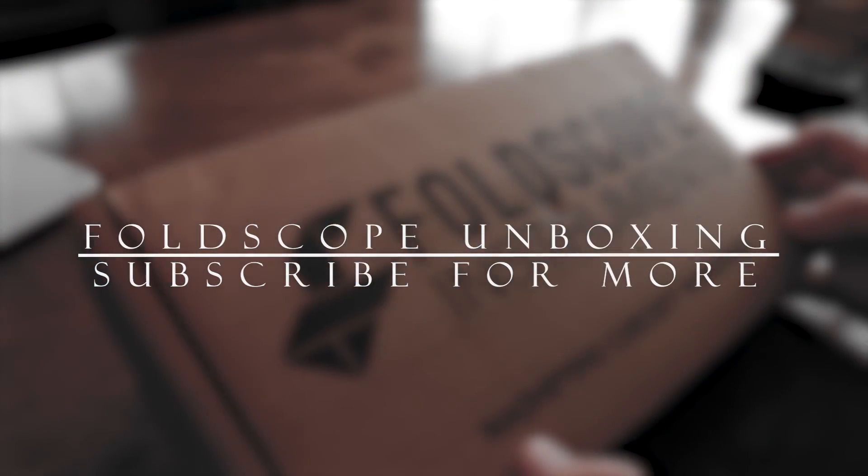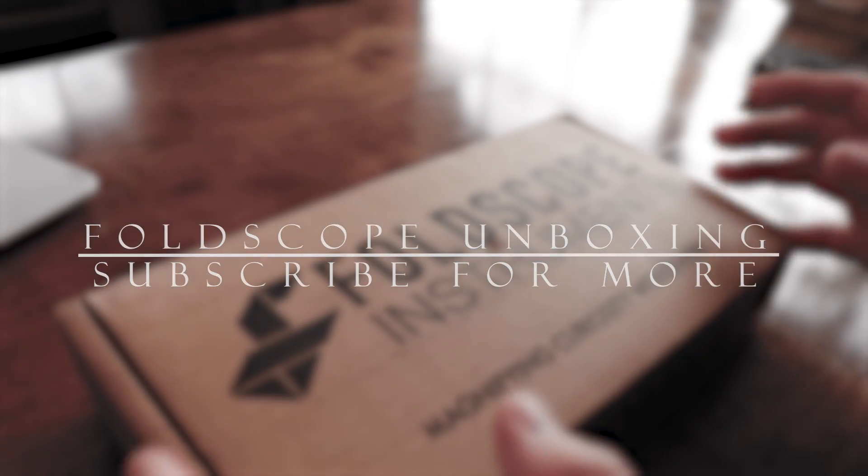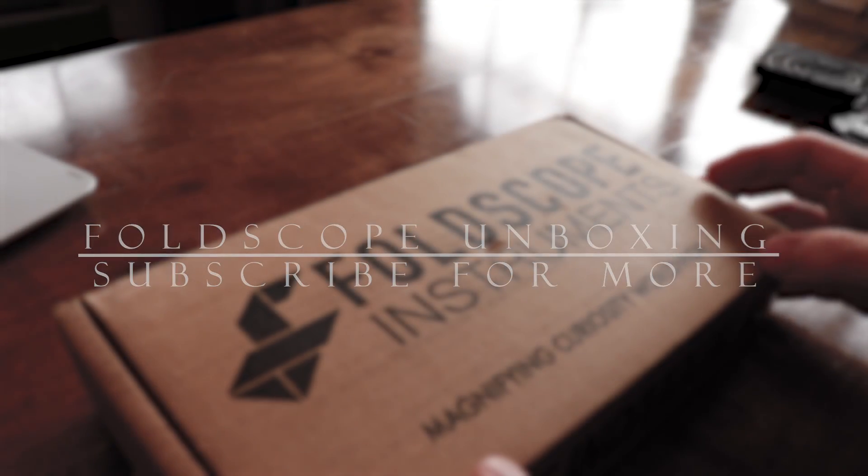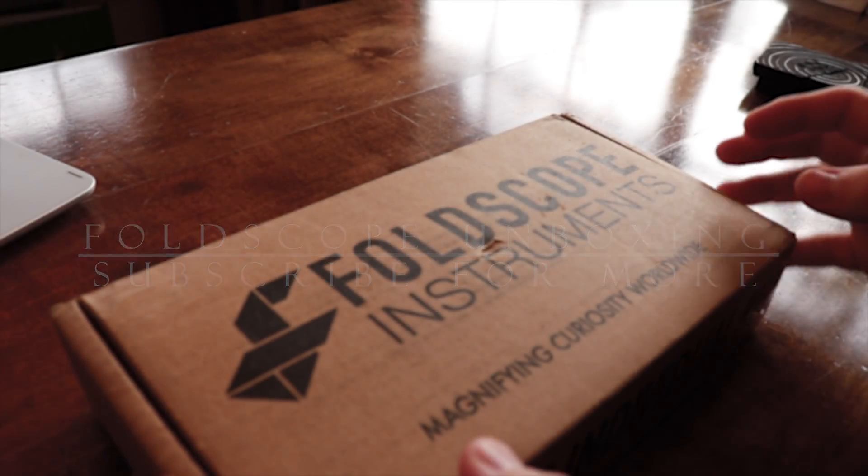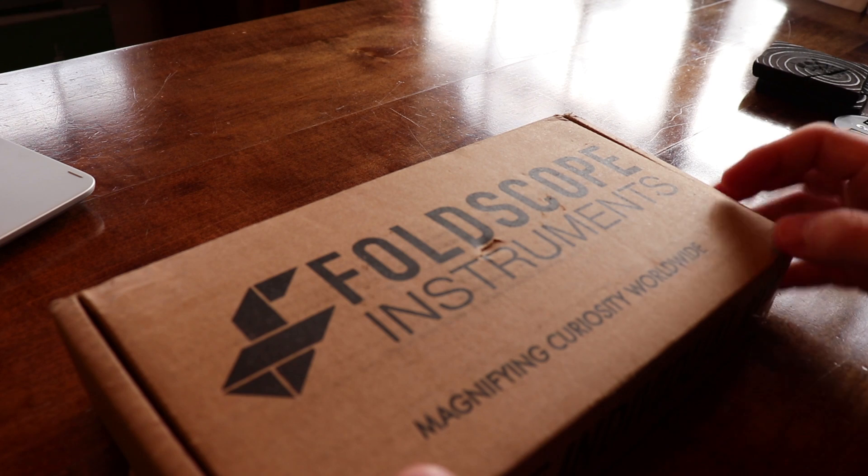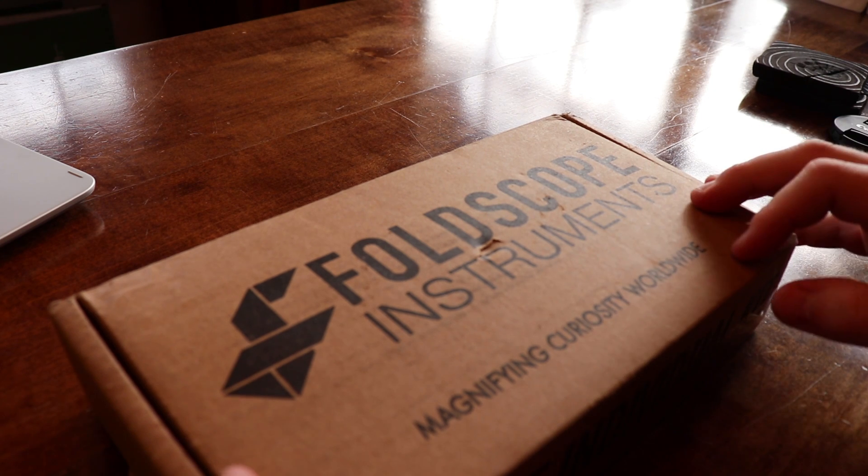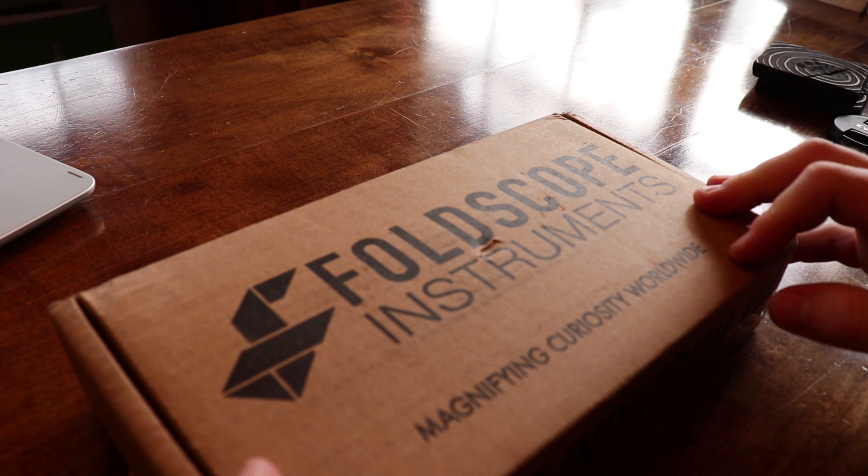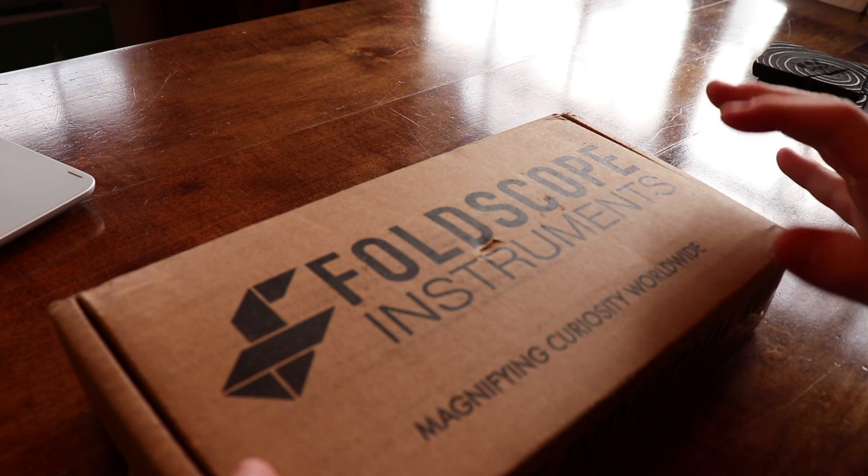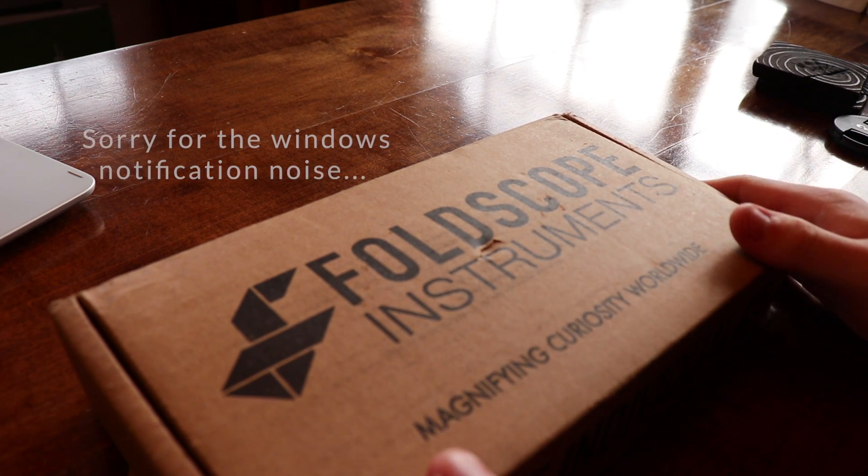Hello YouTube. Today I'm going to be showing you an unboxing and a first impression of the Foldscope.